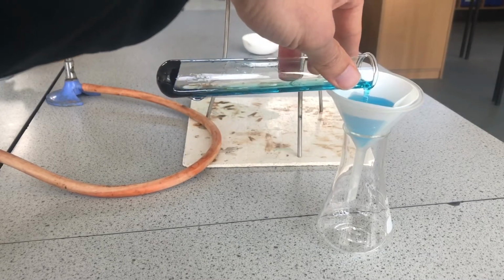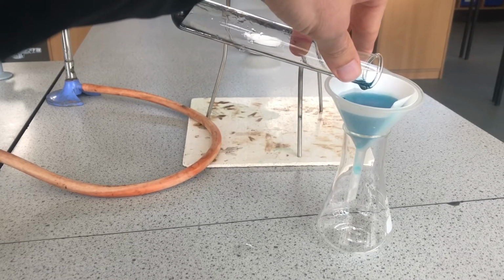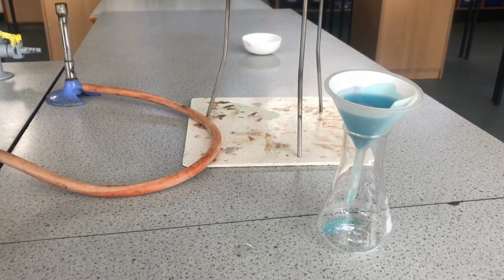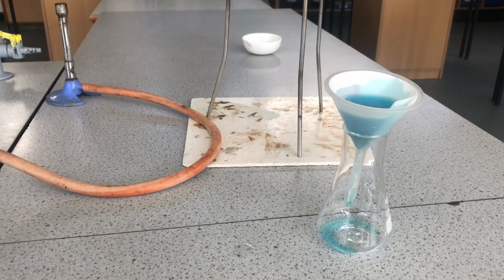Now, I've left this to settle for quite a while, so we're not going to pour too much copper oxide in there, but some will undoubtedly go into the filter paper. And the filter paper, if you remember, has got lots of tiny little holes in it. Those holes are certainly large enough to let the water molecules with the dissolved copper sulfate ions through, but they're small enough to keep the copper oxide particles, the solid particles, behind.